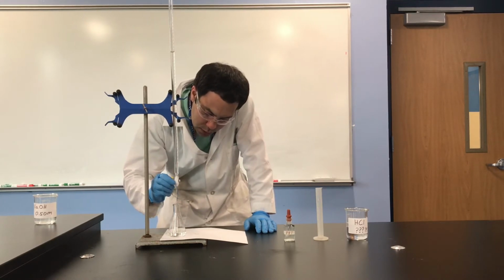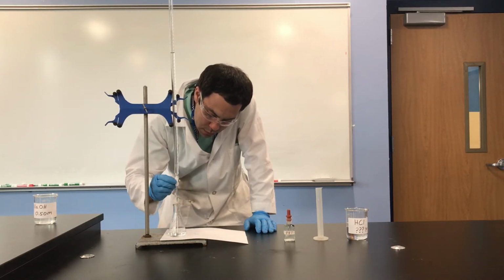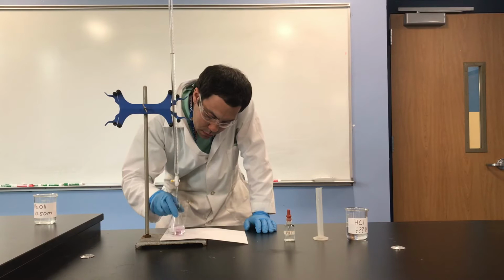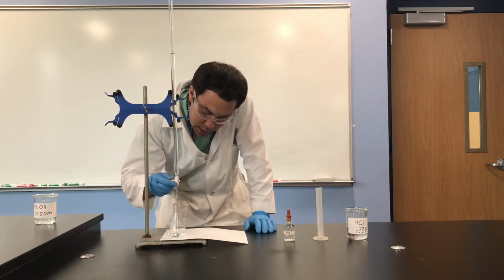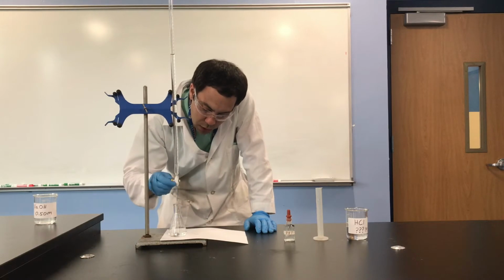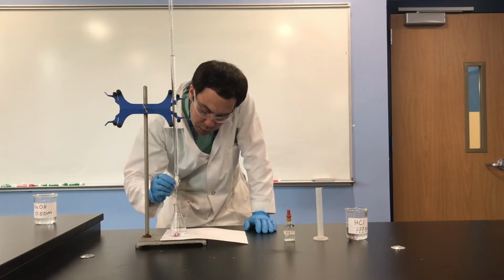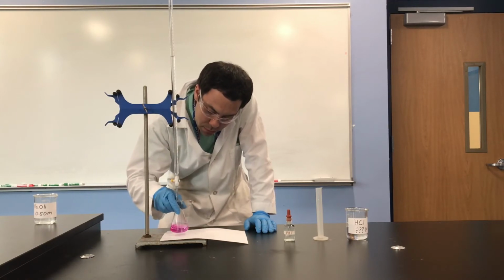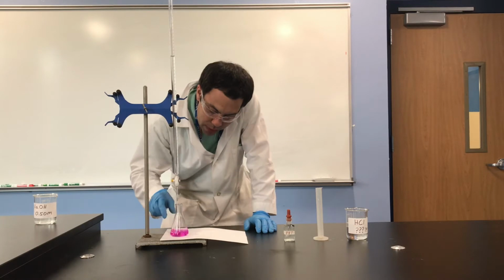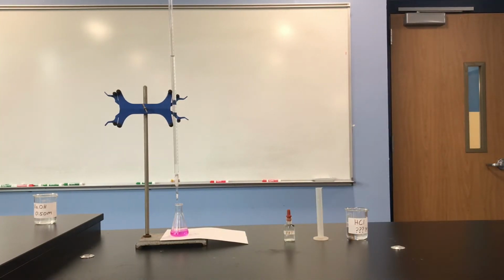Getting closer. But not quite there. You don't want to go too quick because if you go too far, it's going to turn very pink and you will have to start the experiment over again. So right there we have a faint pink. We'll get a little closer.